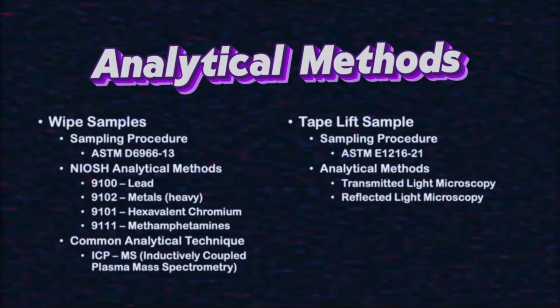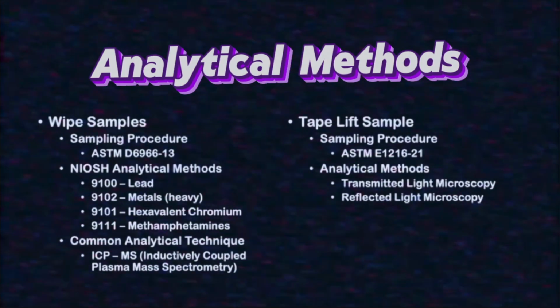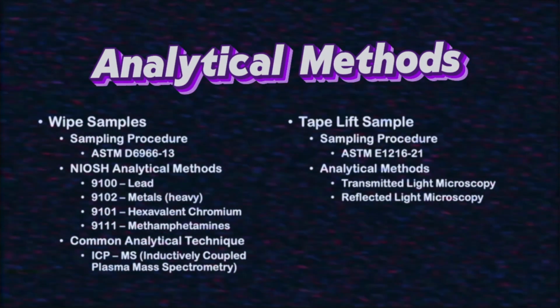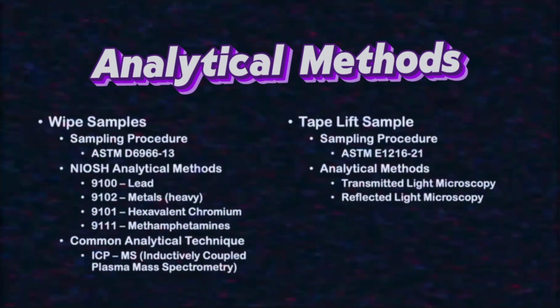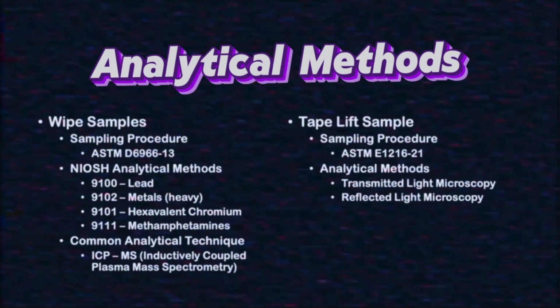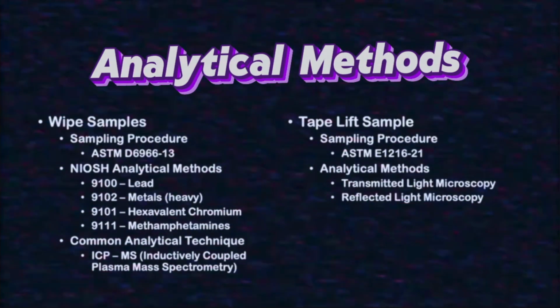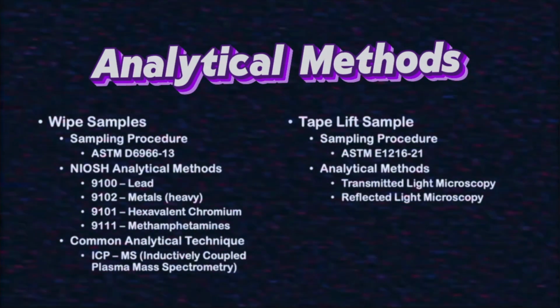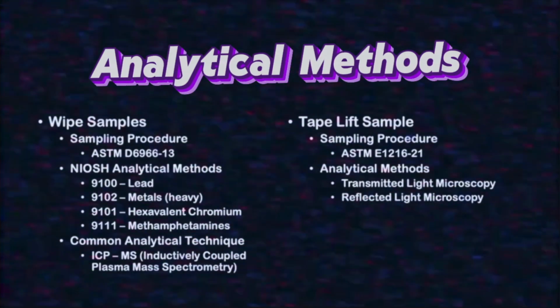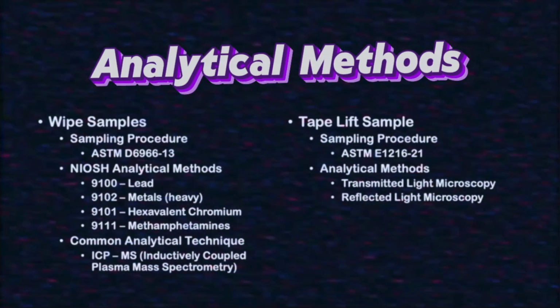Tape lift samples collected following ASTM E1216 procedures are commonly examined using transmitted or reflected light microscopy. The laboratory transforms dust into data. The industrial hygienist then transforms the data into a report, and someone else transforms the report into a meeting.